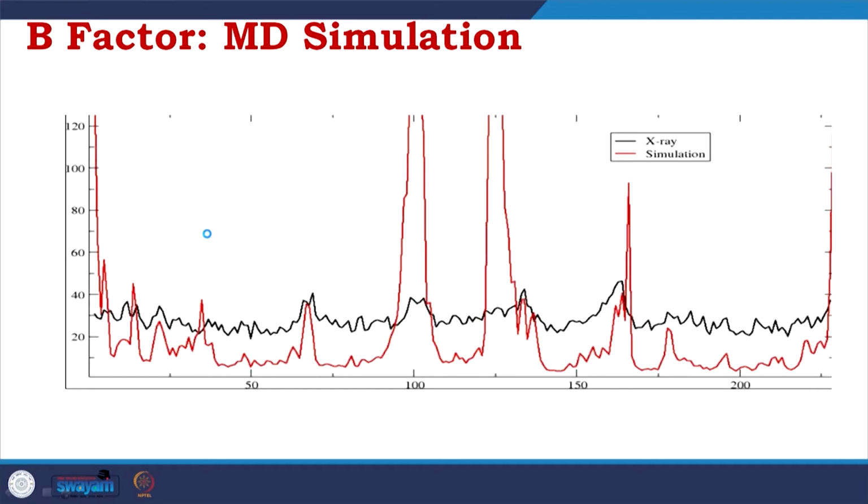For non-bonded it is Coulombic interaction, van der Waals interaction and hydrogen bonds. When you do that, you find which residues, like here nearly 100, are very flexible, most probably loops. You can learn the loop dynamics by applying MD simulation, and by comparing the B factor from the MD simulation and the crystal structure you could easily get the differences.